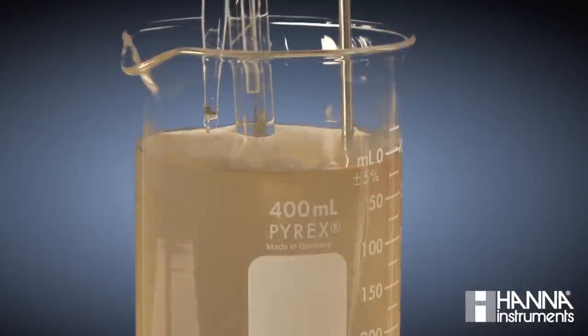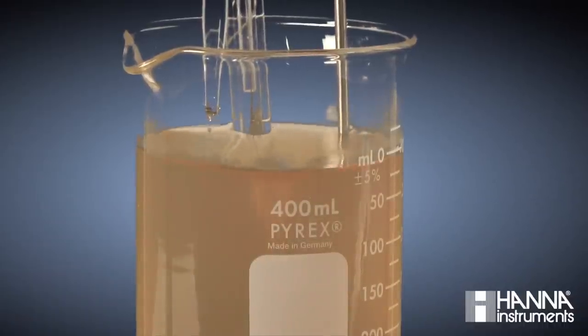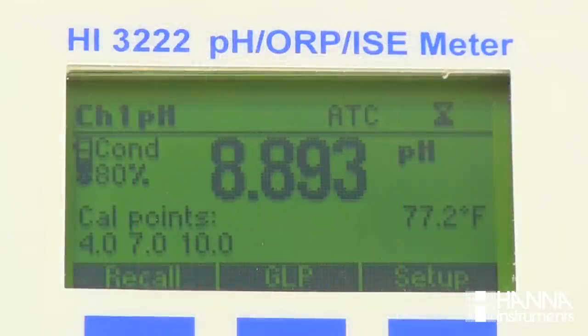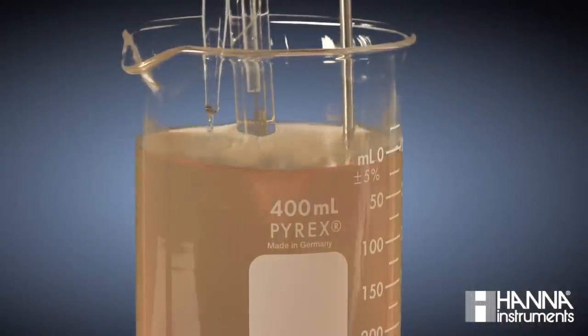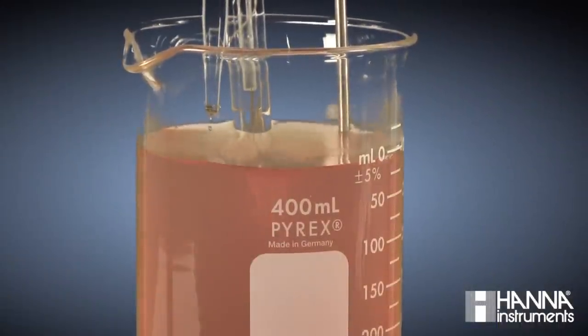I just want to show you that if we dose additional titrant and we go past our endpoint, our pH begins to change again, and our color becomes very vibrant. If a titration gets to this point, the endpoint has been overshot, and our concentration of our analyte would be overestimated.